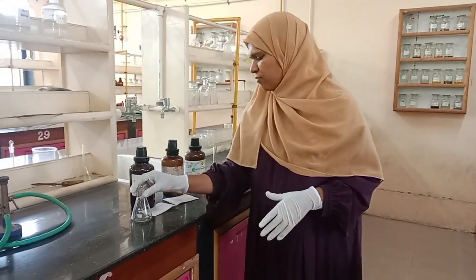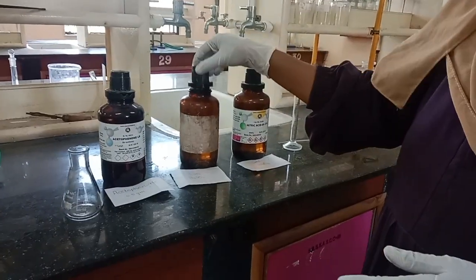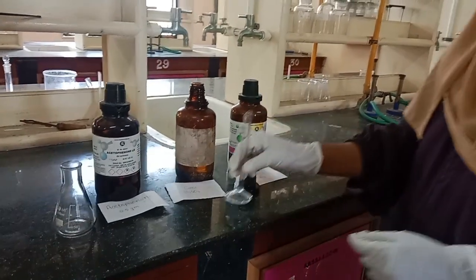a conical flask in which you take 2 ml of concentrated sulfuric acid by measuring. Then you can cool it in an ice bath.